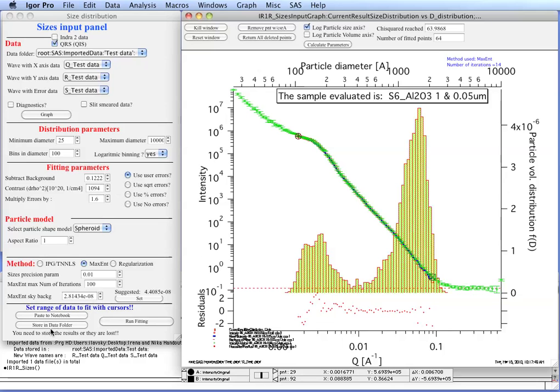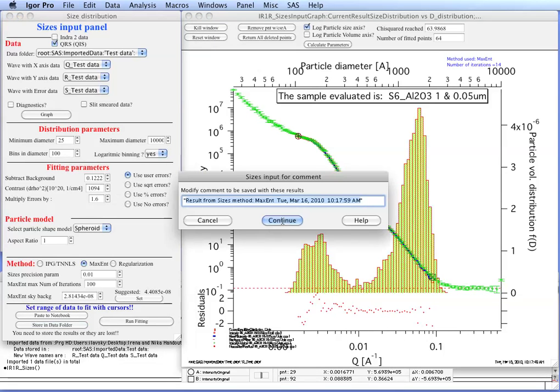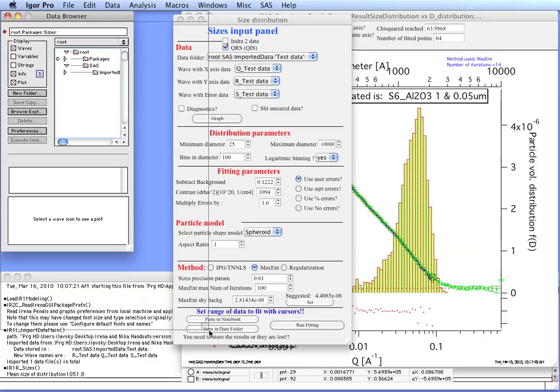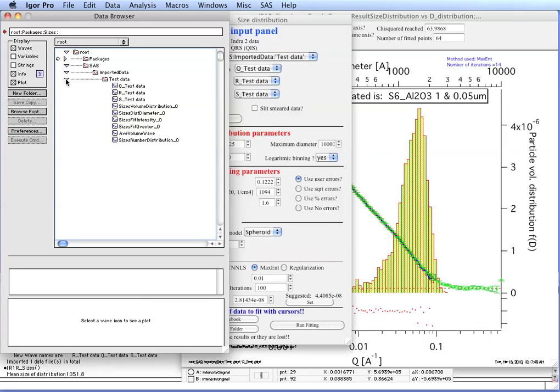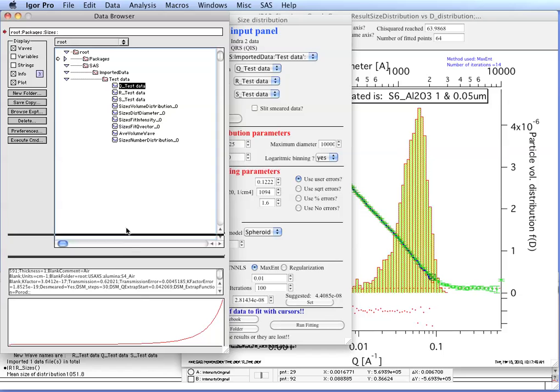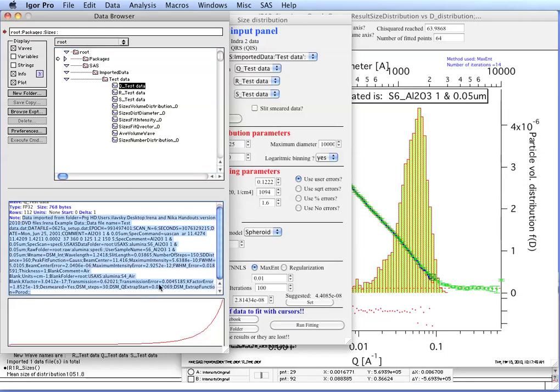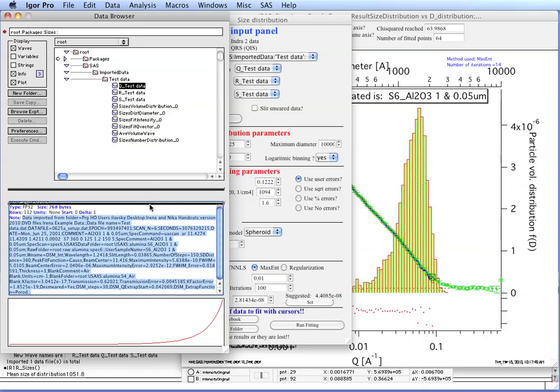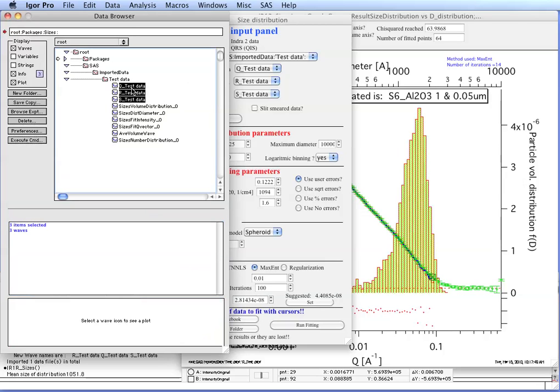You can now, when you are happy with the results, actually say store in data folder. What that does - and you can actually make notes here, there's a predefined note here where you can change that - it adds, if you look in data browser, new waves. So in the folder TestData where we imported the data, we actually got these 3 waves that were imported in Igor. If you look at them, you actually find out that the import tool has added all the wave note, all the header in the wave note here, so it's available to you and you can always find what you have in there. So we have these 3 data sets, these waves.